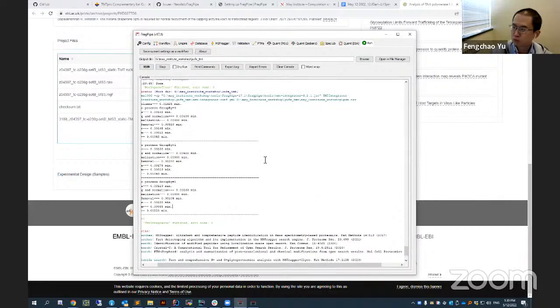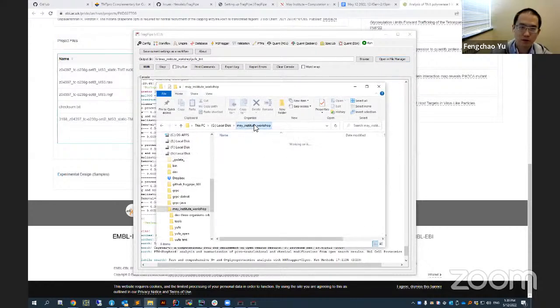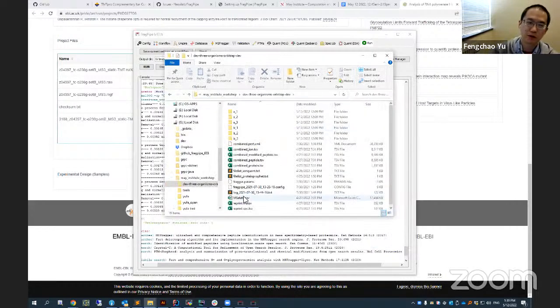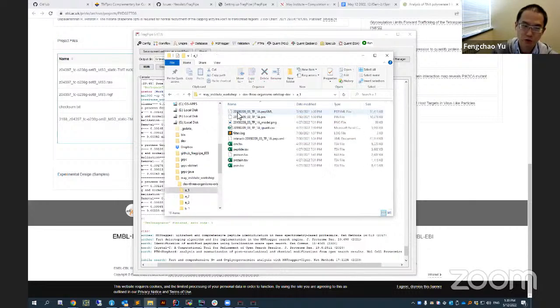Okay, so let's go to the TMT result. I have a TMT result somewhere. Not TMT, label-free quantification result, since I just finished talking about the LFQ workflow. So I have this small data set with 6 experiments. Each experiment has one folder for it, with individual results for this experiment.